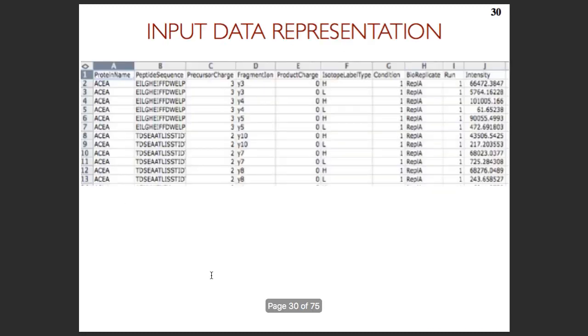So what you would need to do is essentially create this type of annotation. Sometimes you do it automatically, sometimes by hand, depending on how you work. And this is what we will parse. So this is not quite yet the proteins, right? It's really the samples. And so if you say this is biological replicate A, B, and C, and then you say condition one, and then you go again and say A, B, and C, and you will have condition two, then we know that the same people were in two conditions.